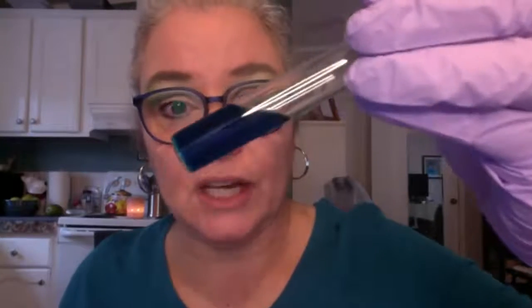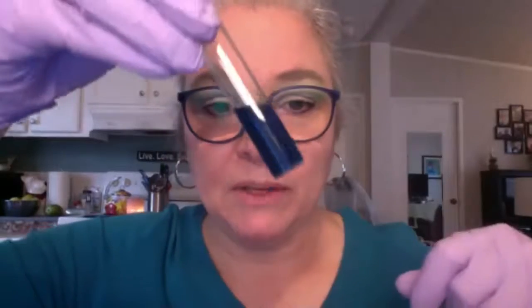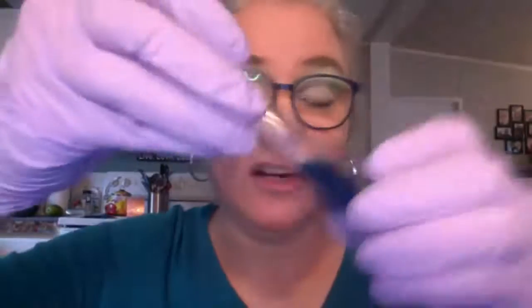I don't have a positive slant tube to show you, but I do have a positive broth tube I can show you. And that's this one. Look at that color change. It's really remarkable, isn't it? You're not going to miss this when you see it, green to bright blue. So this is not agar, this is a broth.